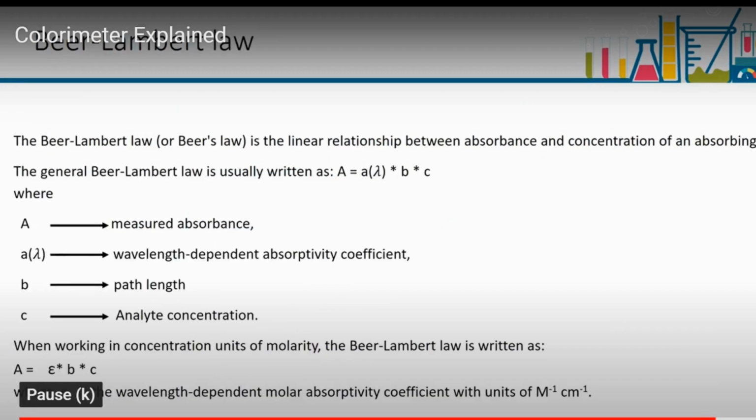The Beer-Lambert law, or Beer's law, is explained here, which we already know. So that's enough. With this we can finish today's session.